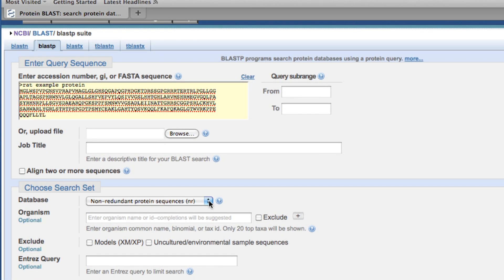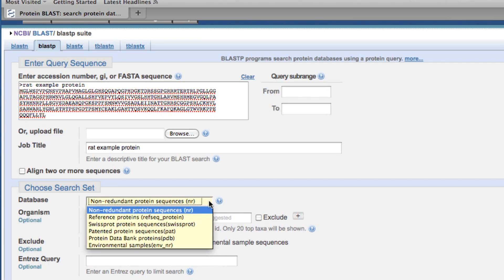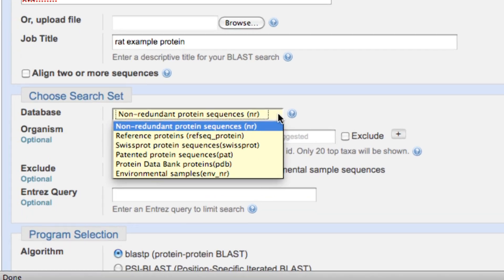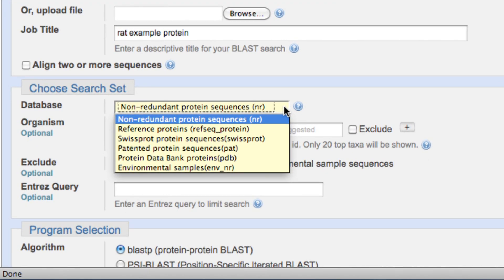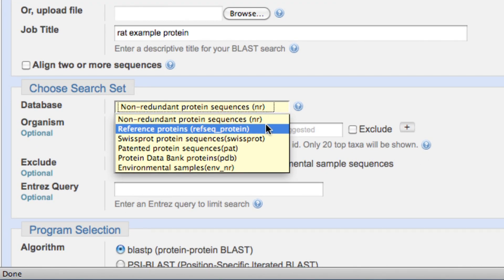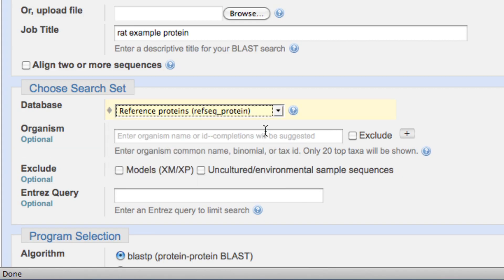The NR database, or the non-redundant database, is actually a very broad database that does include redundant sequences. I'm going to use a little bit higher quality database — a secondary database called the reference proteins. What that will do is limit my output so I don't get duplicate sequences in my output.